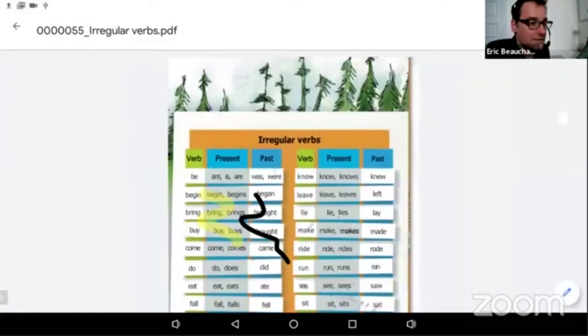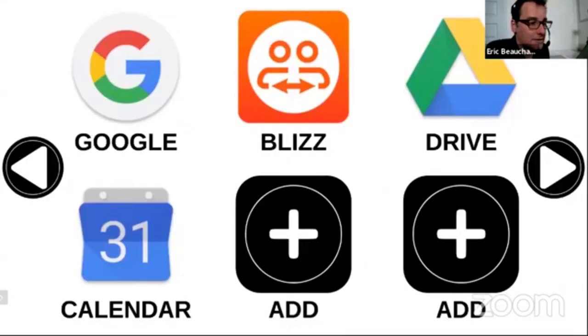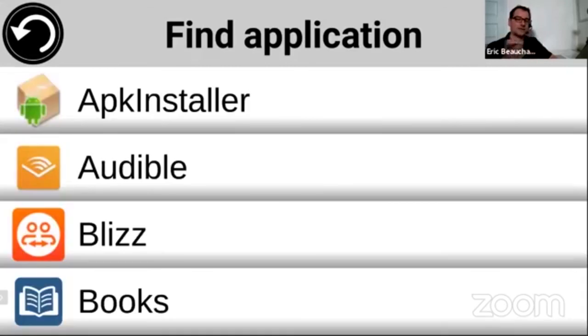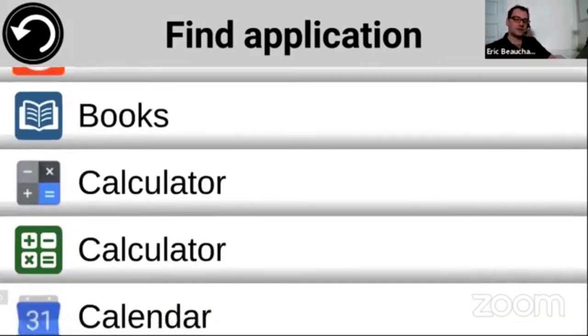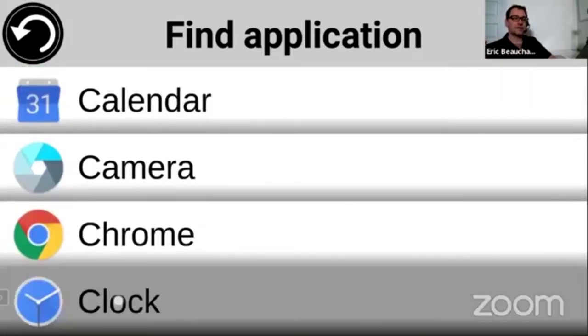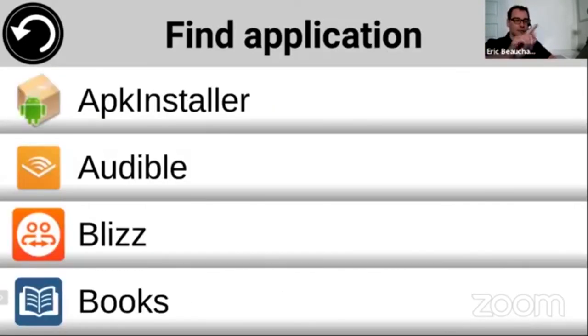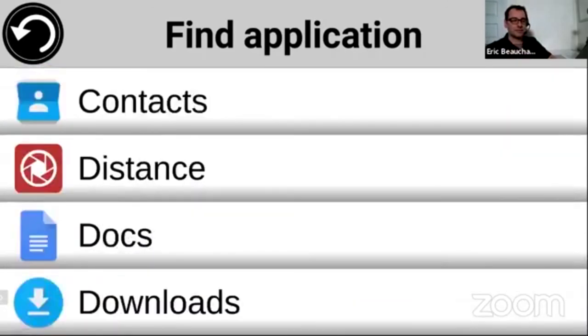Is there a limitation on the number of apps one can place on the quick access? On the quick access menu, when you're using the carousel, the big icons, there is a limit, because if you have a big carousel that you swipe like that, it's going to take longer to get to, say, the 20th application at the end of the list than to just scroll up and down in the apps list.